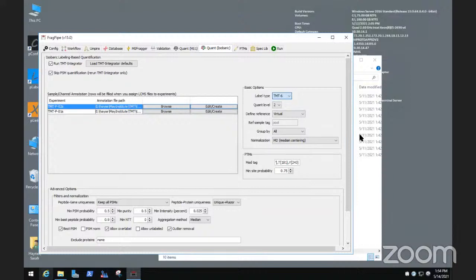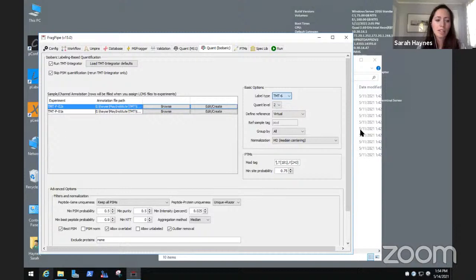So the short answer is we don't have that correction, and the long, complicated answer is that I'm not sure that we want to have that correction. I don't know what you think, but this is what my thinking is at the moment, at least. Yeah, someone, I think maybe on the YouTube live stream, said that this made a big difference for the proteome profiling experiment. So that's something that maybe we could look into and see if it's worthwhile for that.